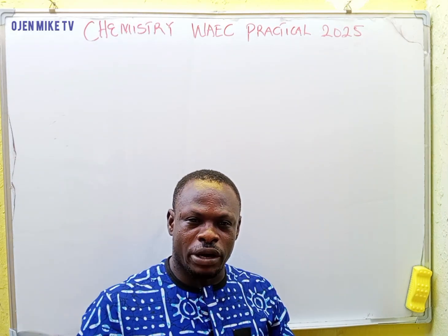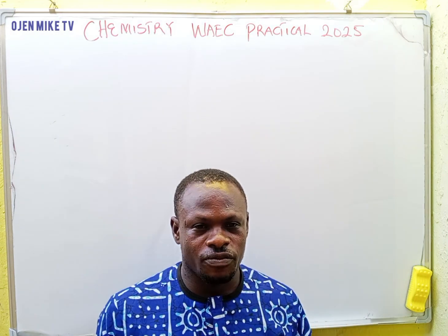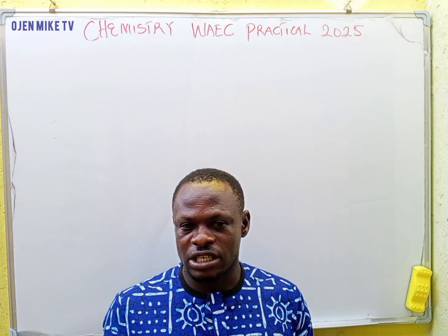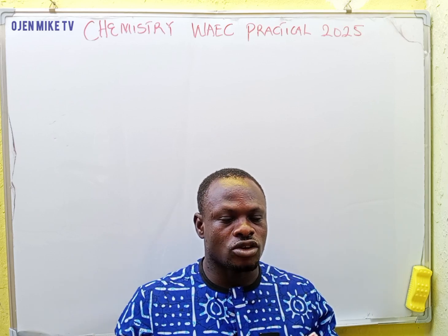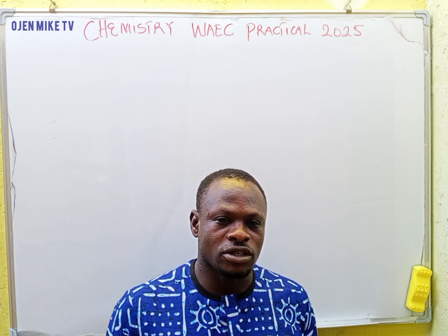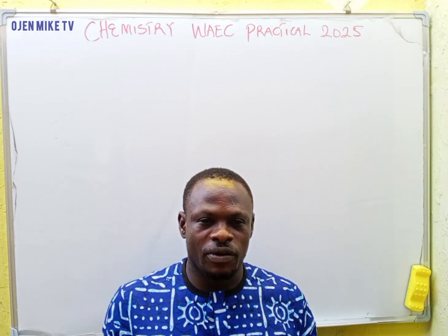Remember, chemistry practical in WAEC is divided into three. We have the quantitative analysis, which involves titration. We have the qualitative analysis, which involves the analysis of salts, and the other one is just a test of chemistry to know how well you understand chemistry. But in this video, we want to look at qualitative analysis.